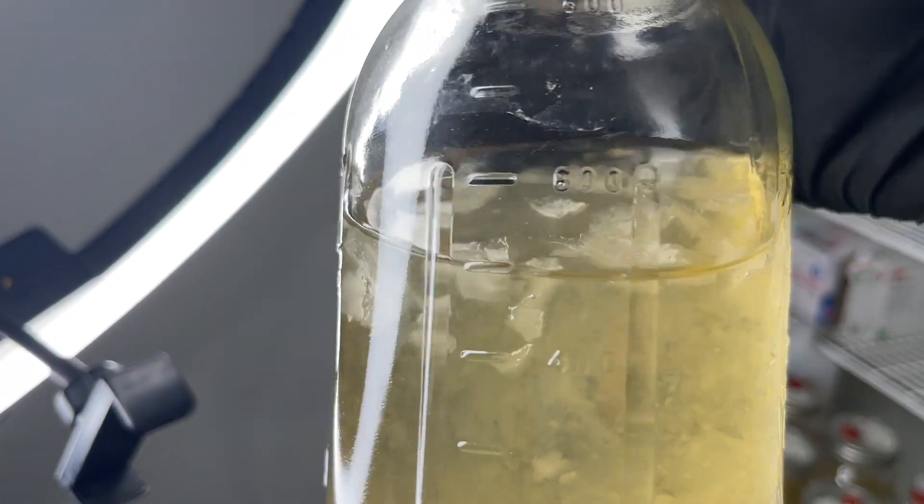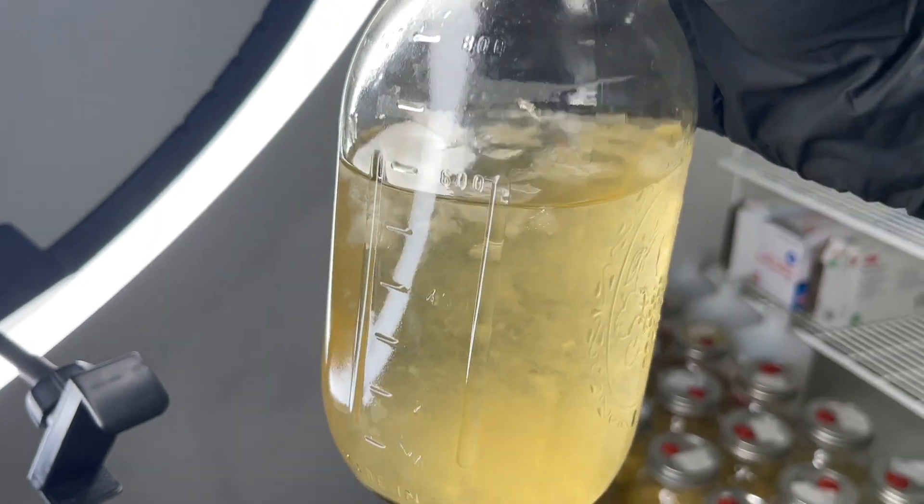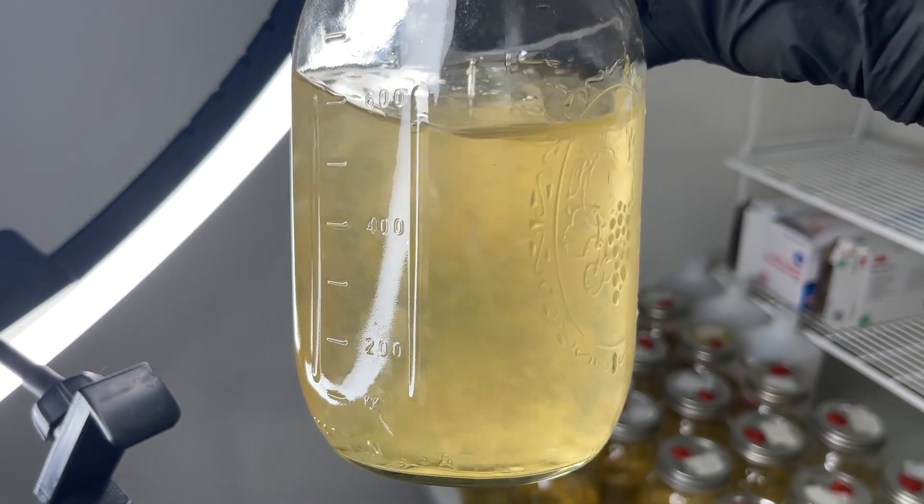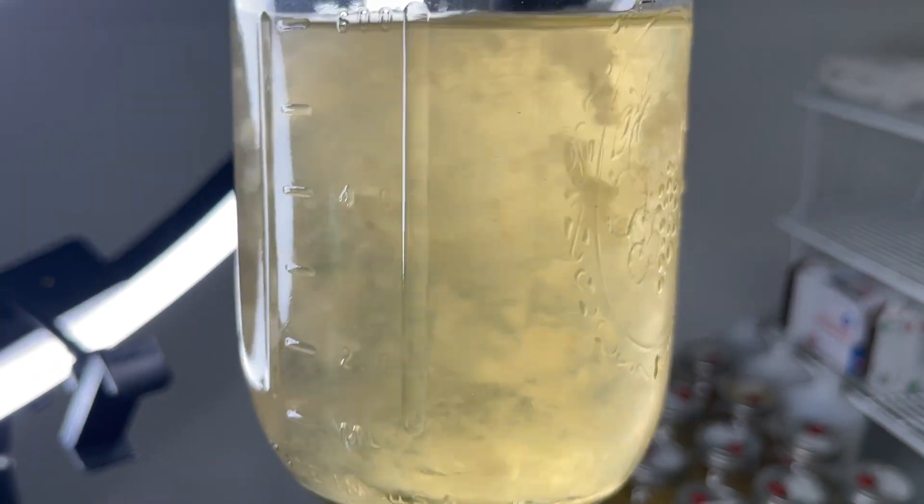This liquid culture is king oyster, which is very aggressive and can grow on the surface if you don't stir it. The mycelium will always be a normal white color.